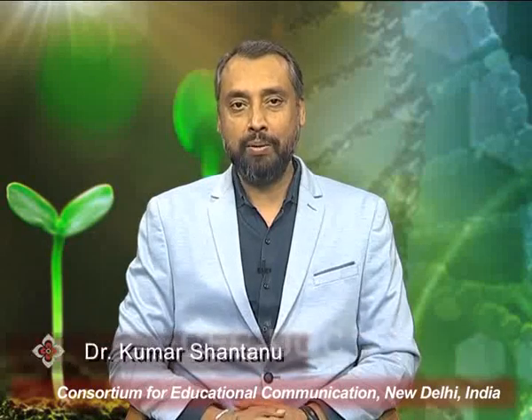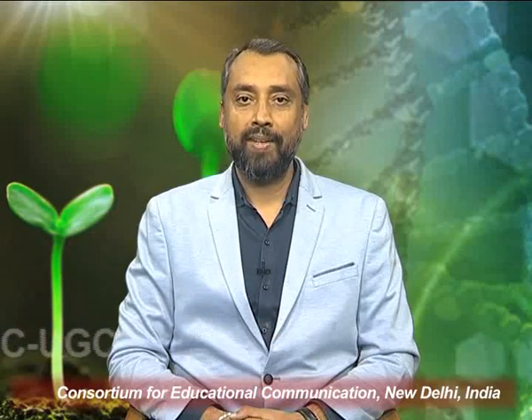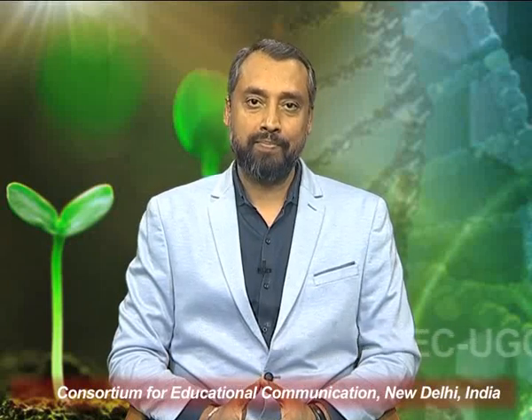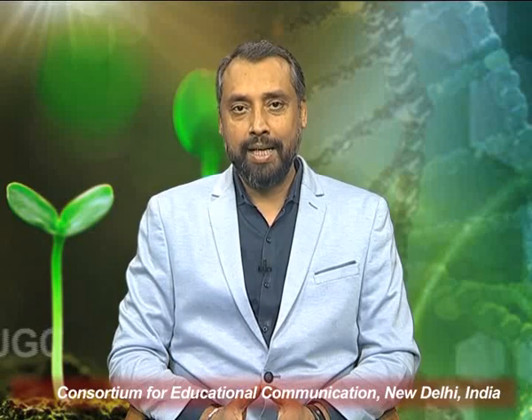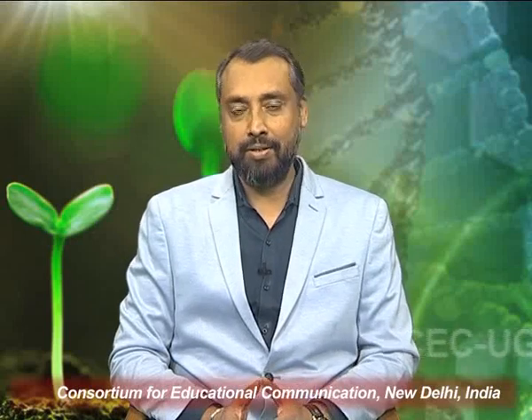I am Dr. Kumar Shantanu, Associate Professor of Botany from Deshbandhu College, University of Delhi. In this series of lectures on basic laboratory equipments, we have already covered some of the very frequently used but basic laboratory tools such as weighing balances, different types of weighing balances, their principles, their advantages and limitations. We have also talked about how pH meter works, what is their working principle. We have also talked about magnetic stirrer.